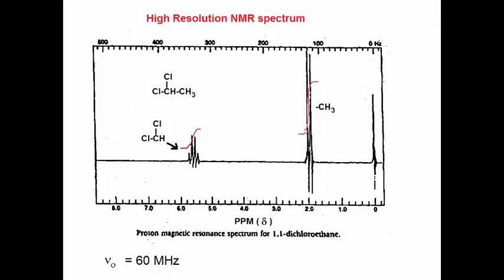The methyl hydrogens in the molecule as signal protons are neighbored by the methine hydrogen. So this signal is due to the methyl group. The methyl protons in the molecule are neighbored by the single methine hydrogen. The single hydrogen is going to exert a magnetic effect on the methyl signal, and as we'll explain, that causes the methyl signal to be split, in this case into two peaks.